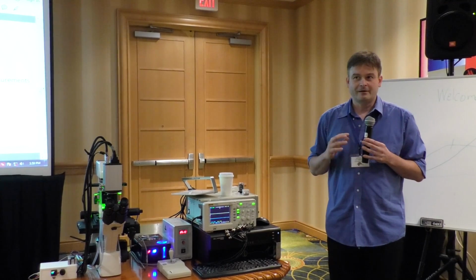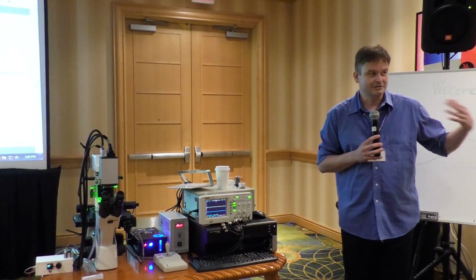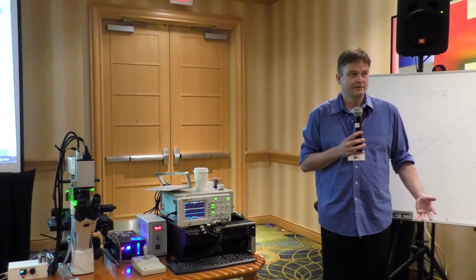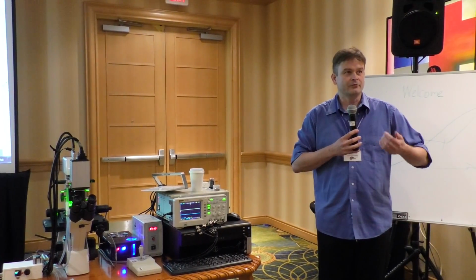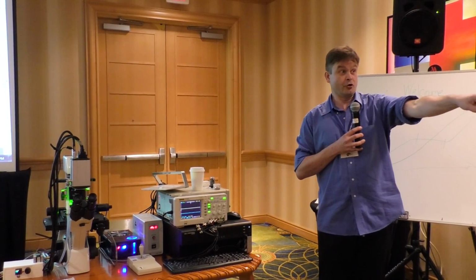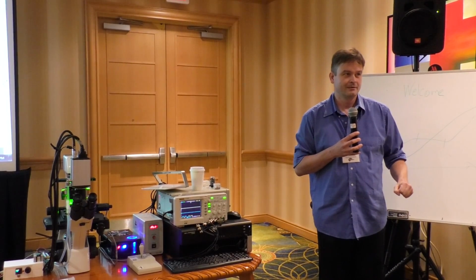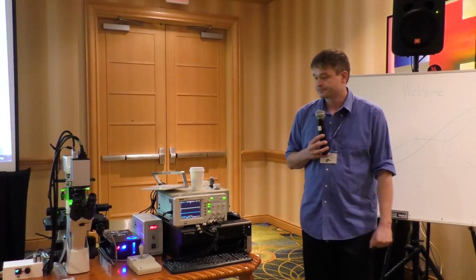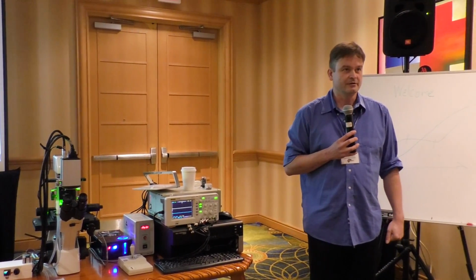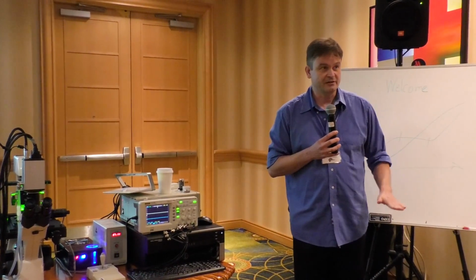Now, side note. In the discussion that we had over the year, more than once the situation arose where somebody felt like we're threatening to say, but your microscope isn't good. That's not what this is about. This is about knowing how good it is, or tracking it over time, knowing, is it doing the same thing today that it did yesterday?